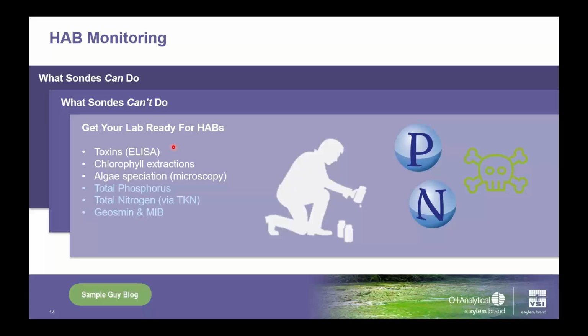People are using ELISA or LC mass spec for measuring toxins, and the good old-fashioned, tried and true: filter it, extract it with a solvent. That is still the way that people do chlorophyll extractions, chlorophyll measurements most often. And of course, algae speciation has to be done with a scope. Today, I'm going to talk to you about these other highly relevant measurements related to harmful algal blooms.